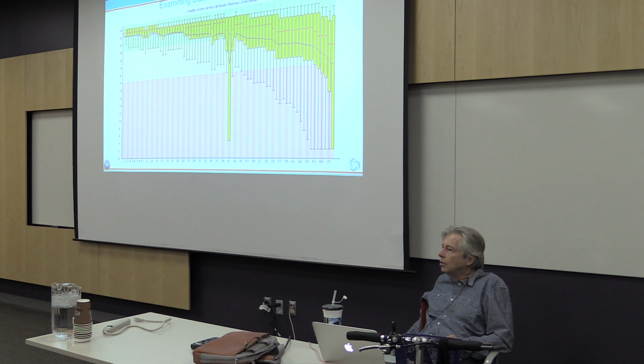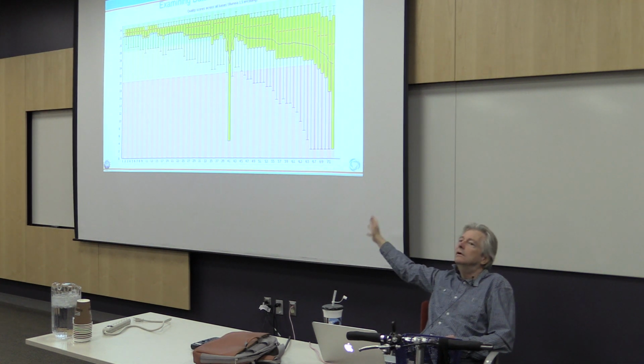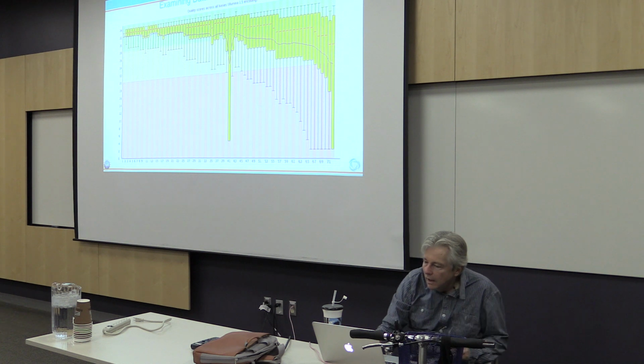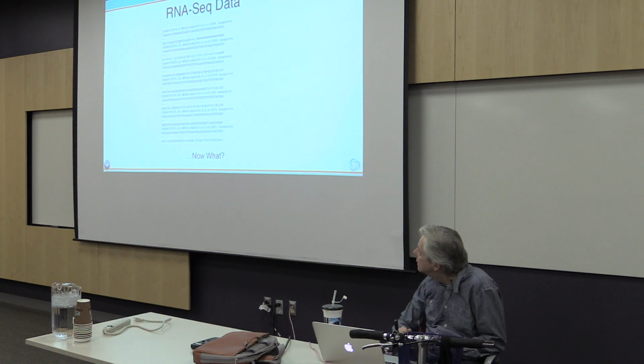So, all that is in there. Some of the reads were fairly intact, and some of them just had a hole in it right there. Doesn't mean you can't use them necessarily, but there are ways of cleaning up the bad pieces. And that's one of the things you have to keep in mind before you start this process. You need to make sure you're working with clean data.